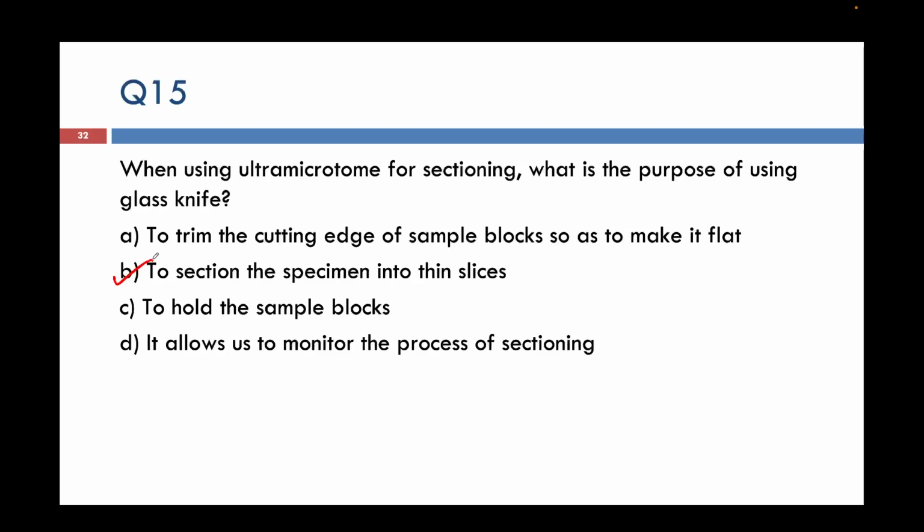The knife will be like this and our specimen will be coming. This is the arm and our knife is like this. It will come and slowly cut in this direction, and here we will put the cup like this, and all these slices will be carried over here.